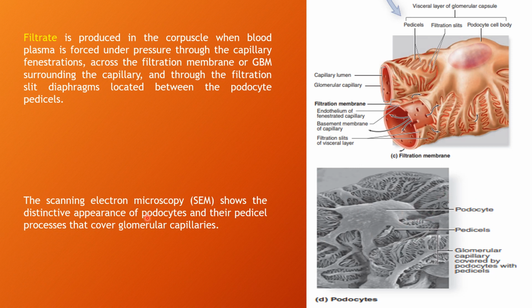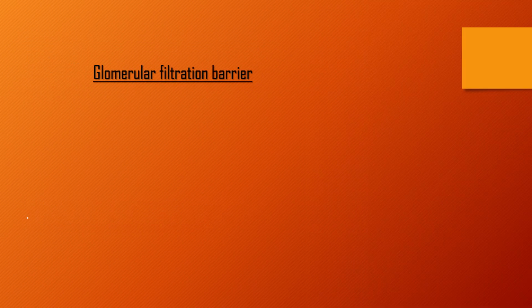This is the scanning electron microscopy, which shows the distinctive appearance of podocytes and their pedicel processes that cover glomerular capillaries. As you can see, this is the glomerular capillaries, which is showing the podocytes on them and pedicel cells.